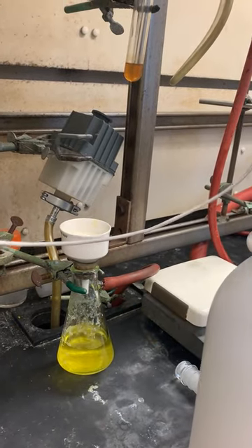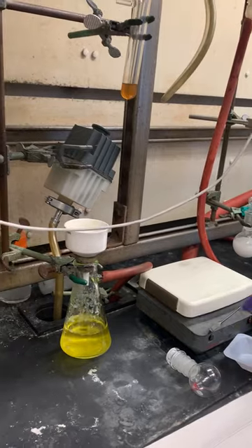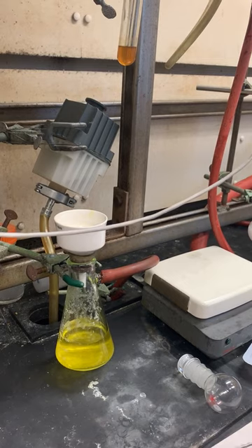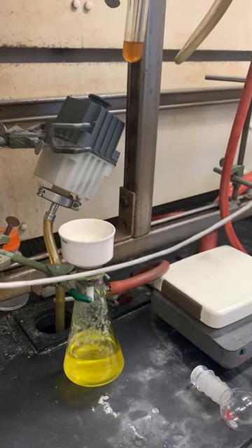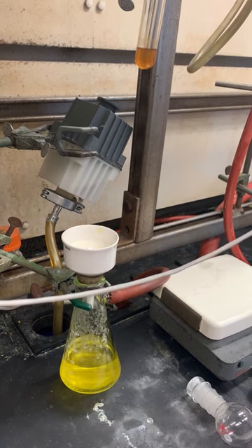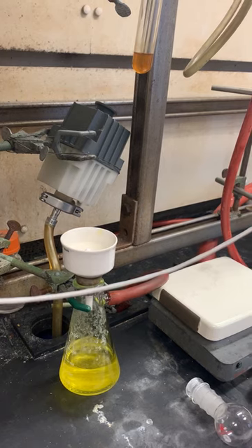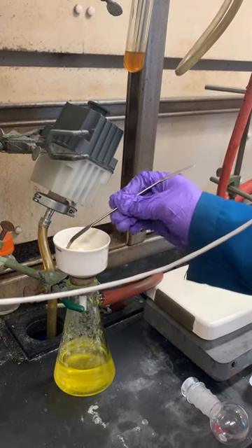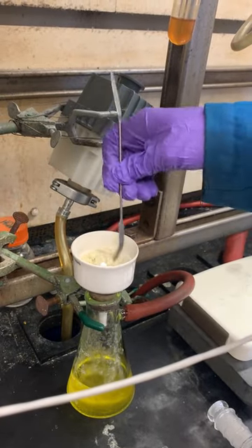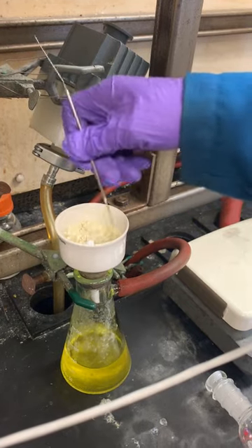We'll let that dry on the Buchner funnel for a few moments, making sure no more solvent is coming out in the filtrate. Once it's drying up, we'll transfer it to a flask. It's getting pretty dry — it's a nice powder. While the vacuum's still on, I'll mix this up a little bit.